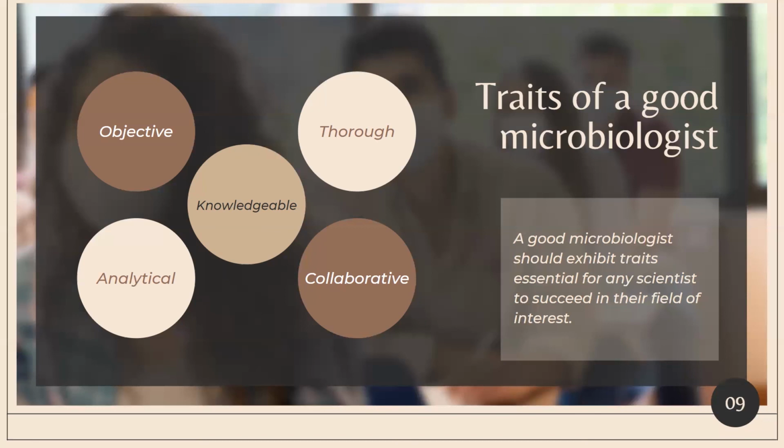Lastly, a good microbiologist is thorough with the research being done by being knowledgeable of the different glasswares and lab equipment, as well as safety equipment to be used. Along with this, the knowledge of the microorganisms to be handled or are applicable for the biosafety level of the establishment to be used is also important. That is all.